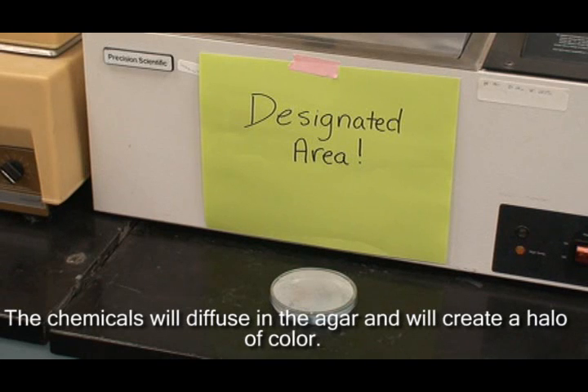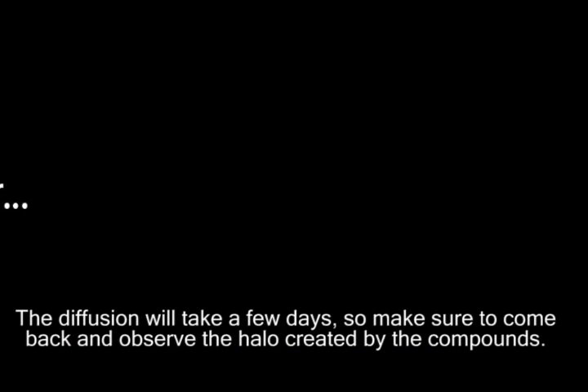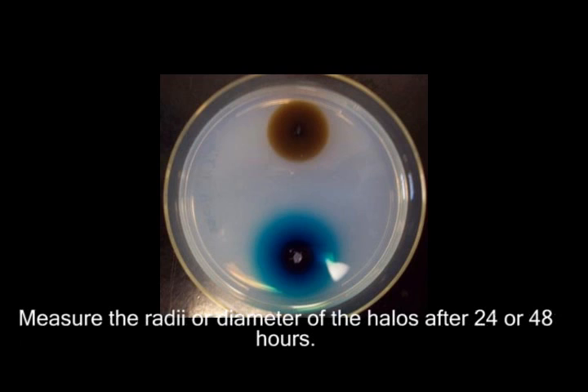The chemicals will begin to diffuse in the agar and create a halo of color. The diffusion can take a few days, so make sure to come back and observe the halo created by the compounds. Measure the radii or diameters of the halos after 24 or 48 hours.